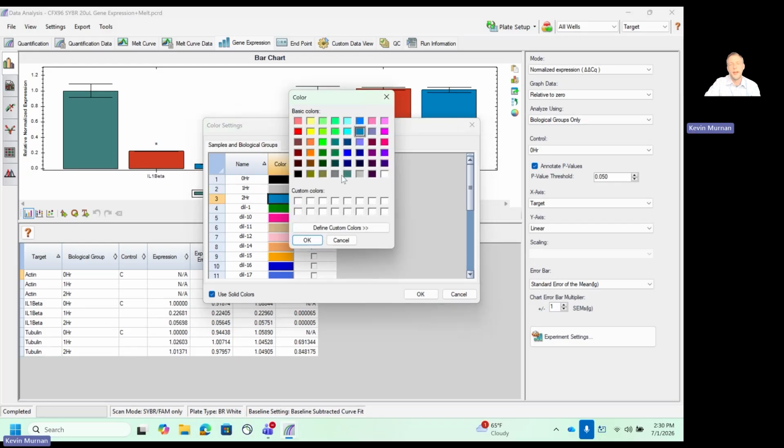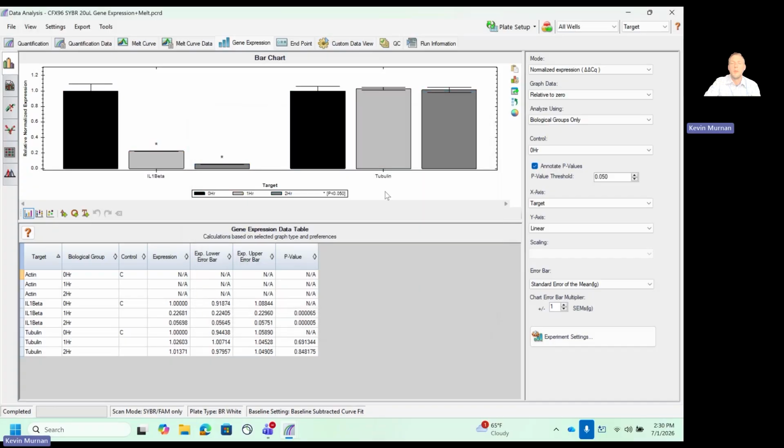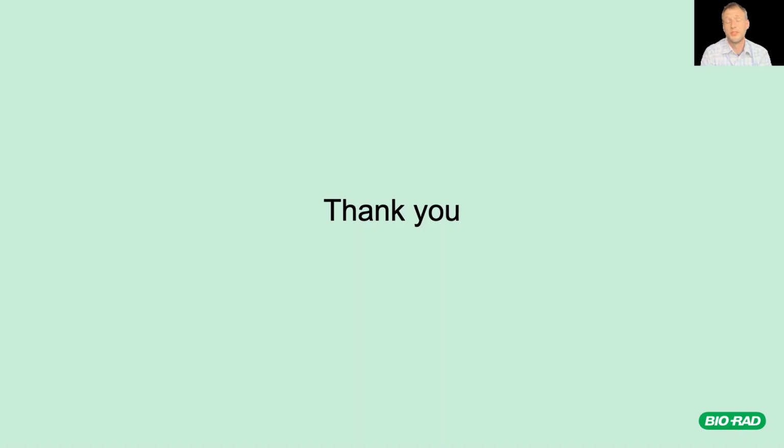And with that, I believe that you are more than equipped to use the CFX Maestro software. Thank you for your time, and I hope you have a wonderful day.